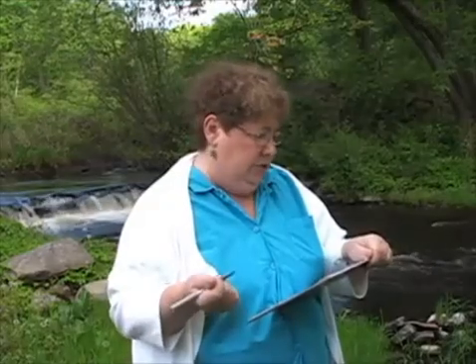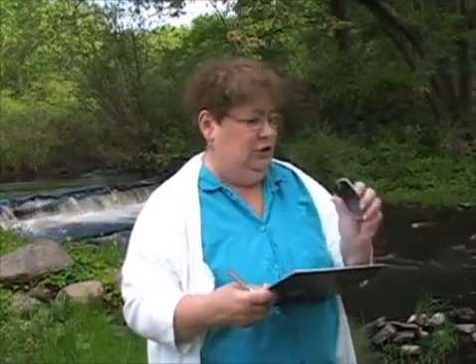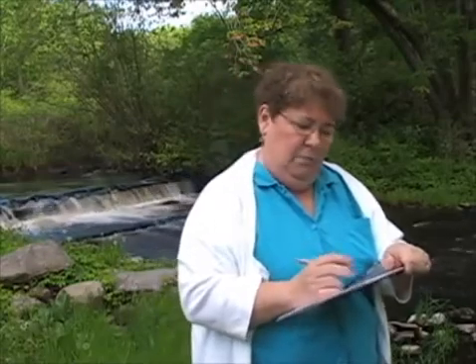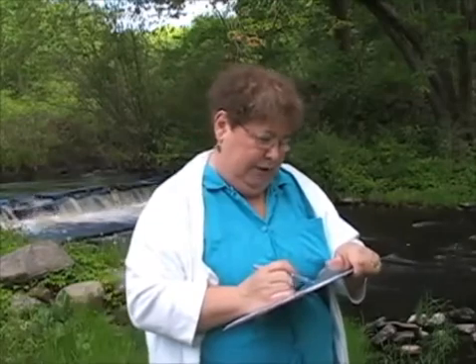Okay, so first we have to fill out the site number. In this case, it's Catacoonamaga CT 0195. The collection date, which happens to be 5/15/10. The collection time, I just checked, 7:57. Site description is Umbagog. Monitor's initials MM. We will be collecting a duplicate set today.